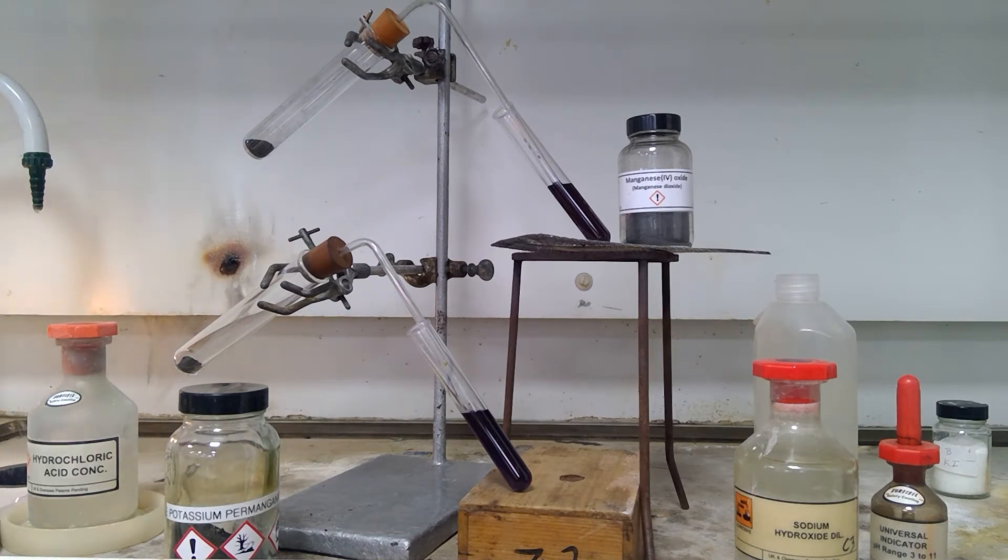The solid manganese compound is in the boiling tube on the left. Concentrated hydrochloric acid is going to be added. The potassium permanganate, potassium manganate 7, is on the left and is the lower of the two boiling tubes. The one at the top is manganese 4 oxide.